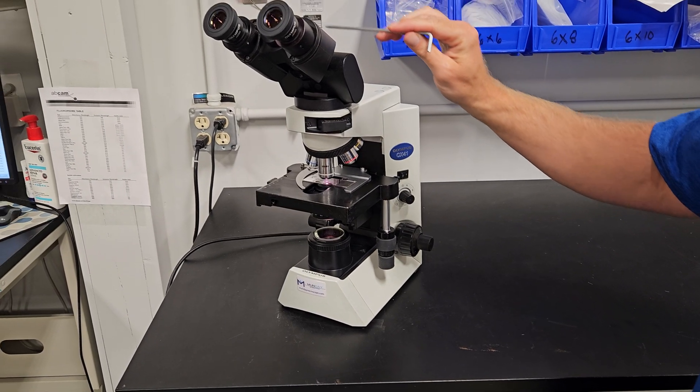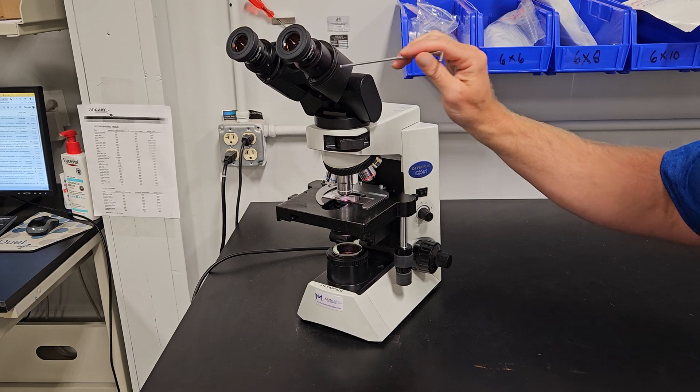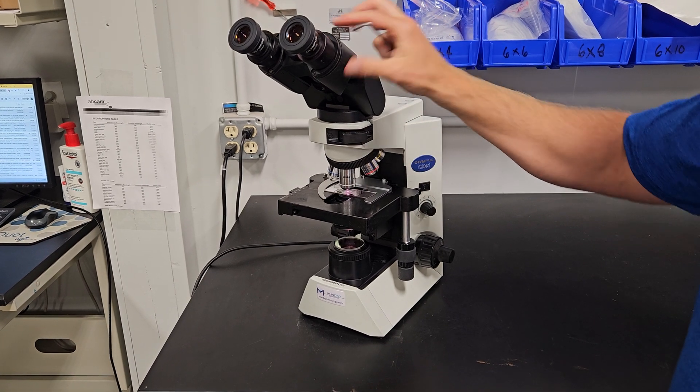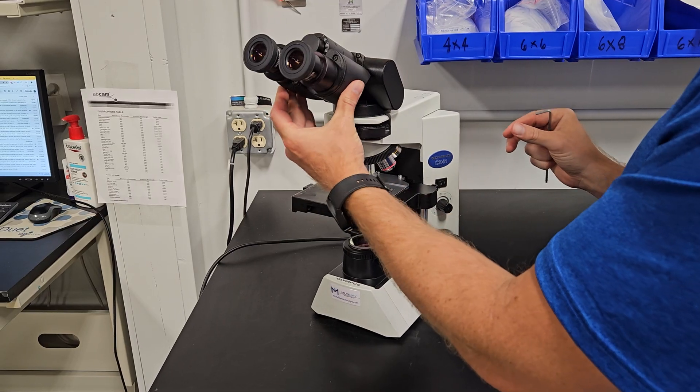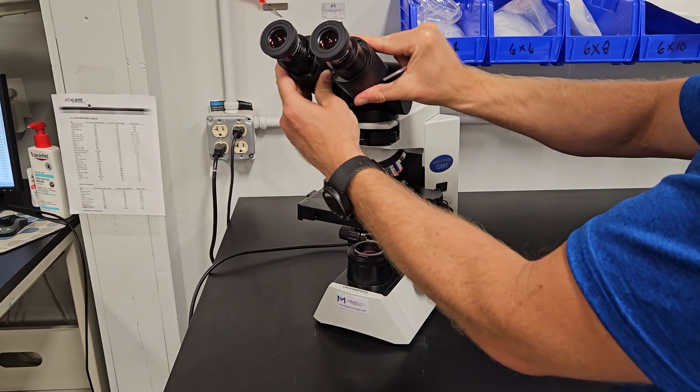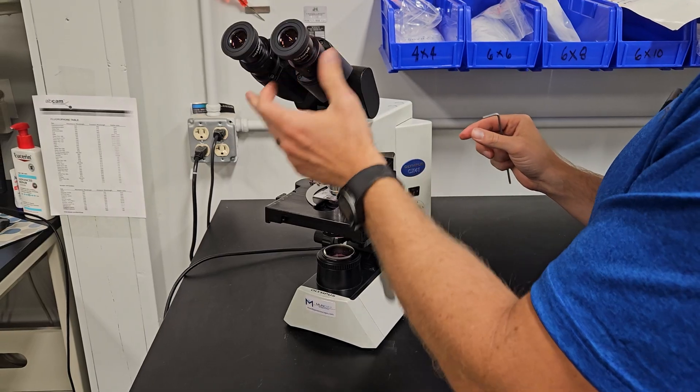They wanted to keep a tilting head. This head right here is a great ergonomic tilting head. It'll be really comfortable for the user. Interpupillary distance moves very nicely, tilts up and down.